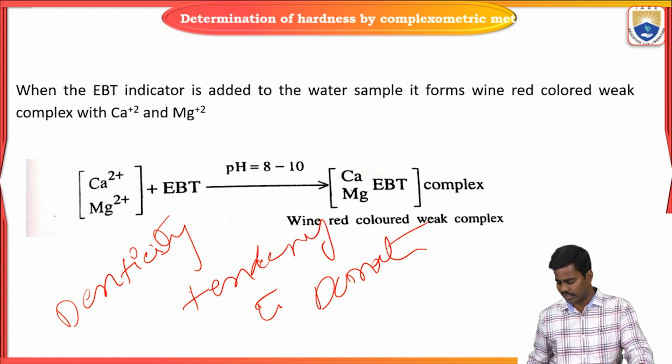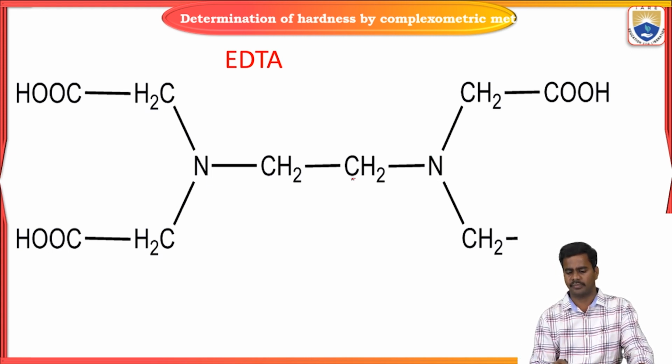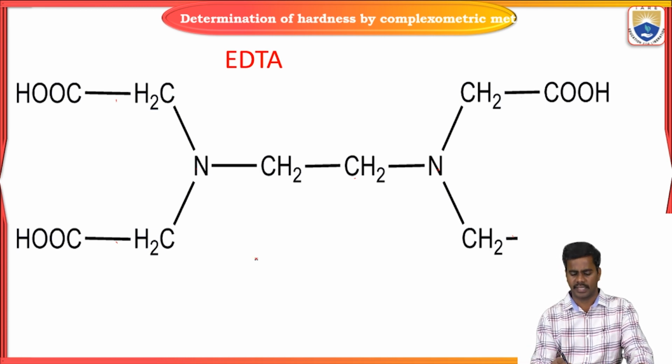Let us see the structures of EDTA and EBT and calculate the denticity. Look here, coming to the EDTA structure. Ethylene diamine tetraacetic acid. It is EDTA.